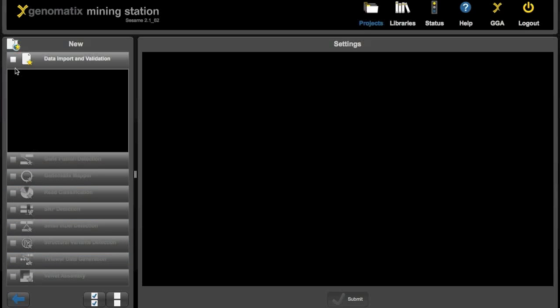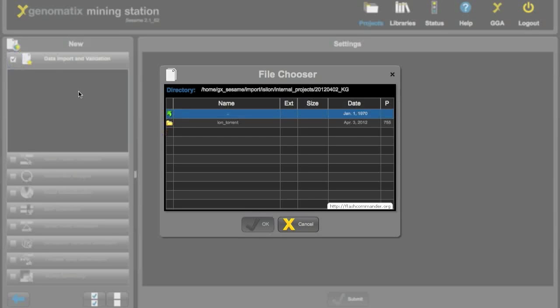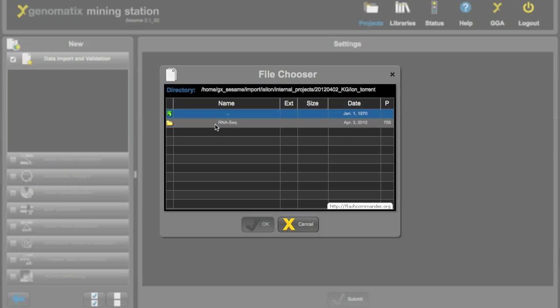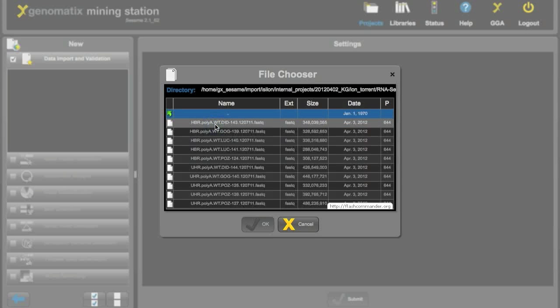First of all now we need to import some data. So we click up here and the file chooser pops up, which allows us to go down to the folder where the raw read files are.